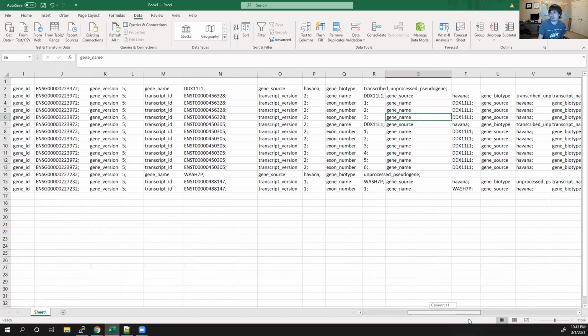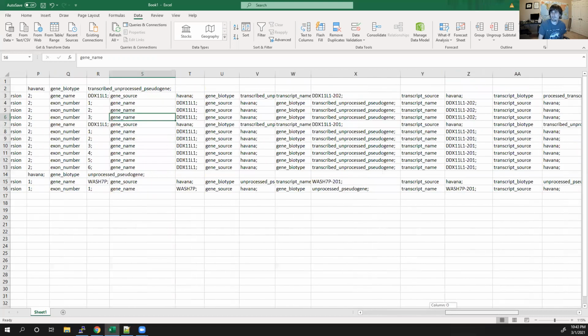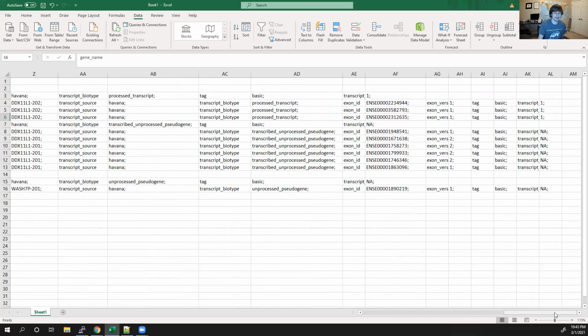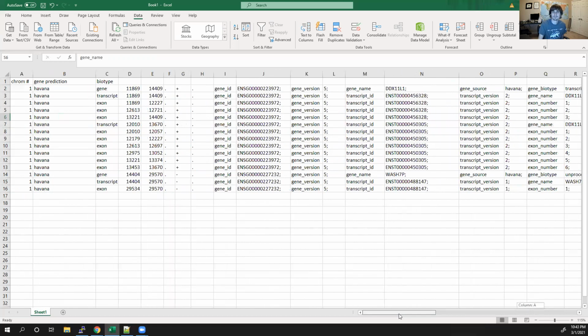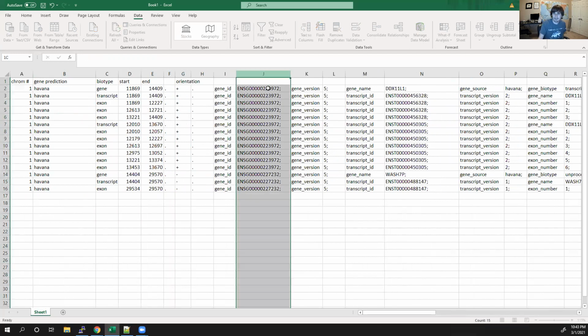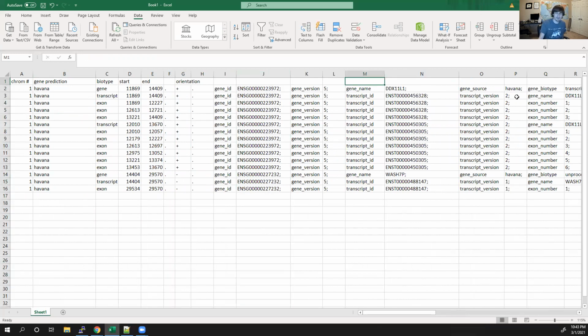Yep, and then a whole bunch of other stuff. But either way, quite honestly, the only reason I know this is because I've looked at several GTF files. And so this will just repeat all the time, right? From chromosome number 1, that's going to be the start, that's going to be the end, and orientation. So those are pretty important columns: chromosome, start, stop, and orientation. That's important generic information. The gene ID is kind of important, and the biotype is pretty important.